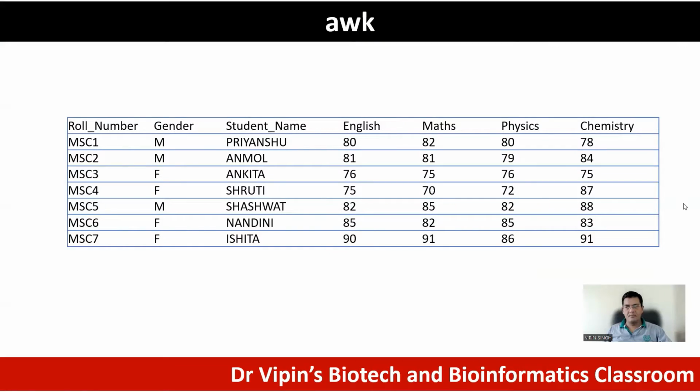I've given you a basic discussion on awk till now with a simple file, which was basically the marks obtained by students in a classroom. Now we move on to a slightly more complex file, that is your Fastq format file, which is typically the file that you get from your next generation sequencers. We'll look into how awk can be used to parse this file to pull out a specific sequence, to check whether a particular pattern is present in your sequence or not, to convert a file from Fastq format to fasta format, and so on and so forth.